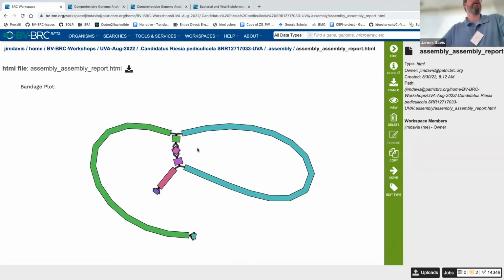Okay, so he's asking how we estimate coverage, because it's a de novo assembly. I believe that the assembler does that, but I could be wrong. It essentially maps the reads back. We use SAMtools to map the reads back. Oh, we do? Okay, there you go. So the answer is that we use SAMtools. I thought that the assembler itself offered an estimation. Some do. Maybe that's why we use SAMtools to go back.